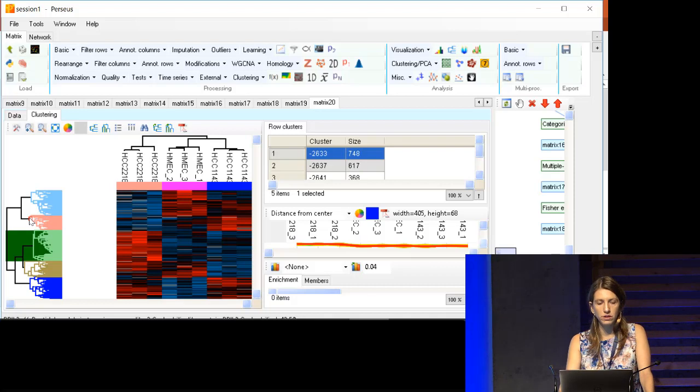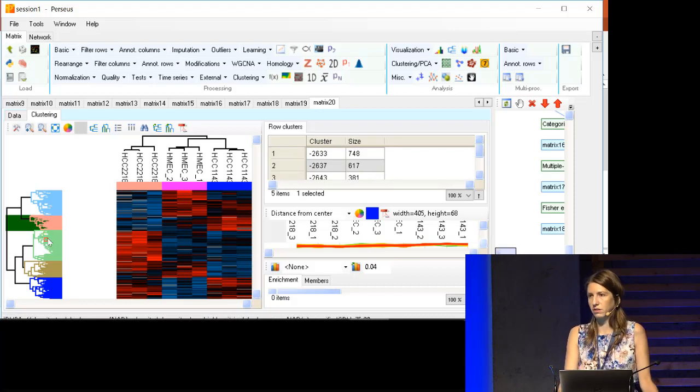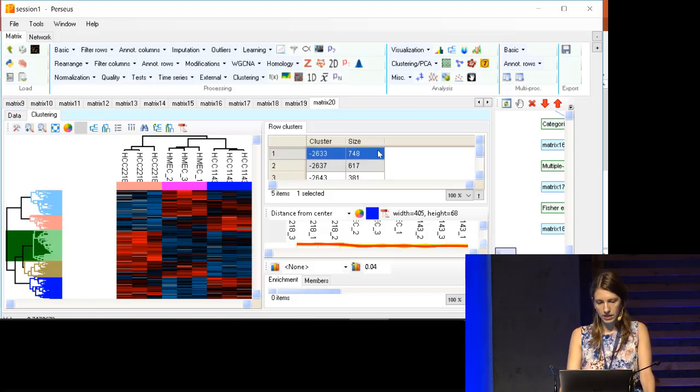If you click on this, then you can define new clusters. Or you can click on the one that is already predefined, but then that's a new cluster, and this would appear here if it wasn't there. And you can really choose anywhere else, so you can manually define clusters. But we'll just select one from the table, any, and we'll check.